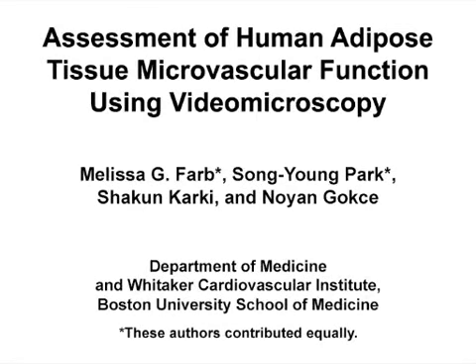The overall goal of this videomicroscopy technique is to examine the functional properties of isolated microvessels in response to pharmacological and physiological stimuli, providing insight into the pathophysiology and molecular mechanisms that contribute to vascular dysfunction in humans. This method is useful for understanding the molecular mechanisms that contribute to dysfunction of the local microvasculature within fat, which has been linked to systemic diseases.